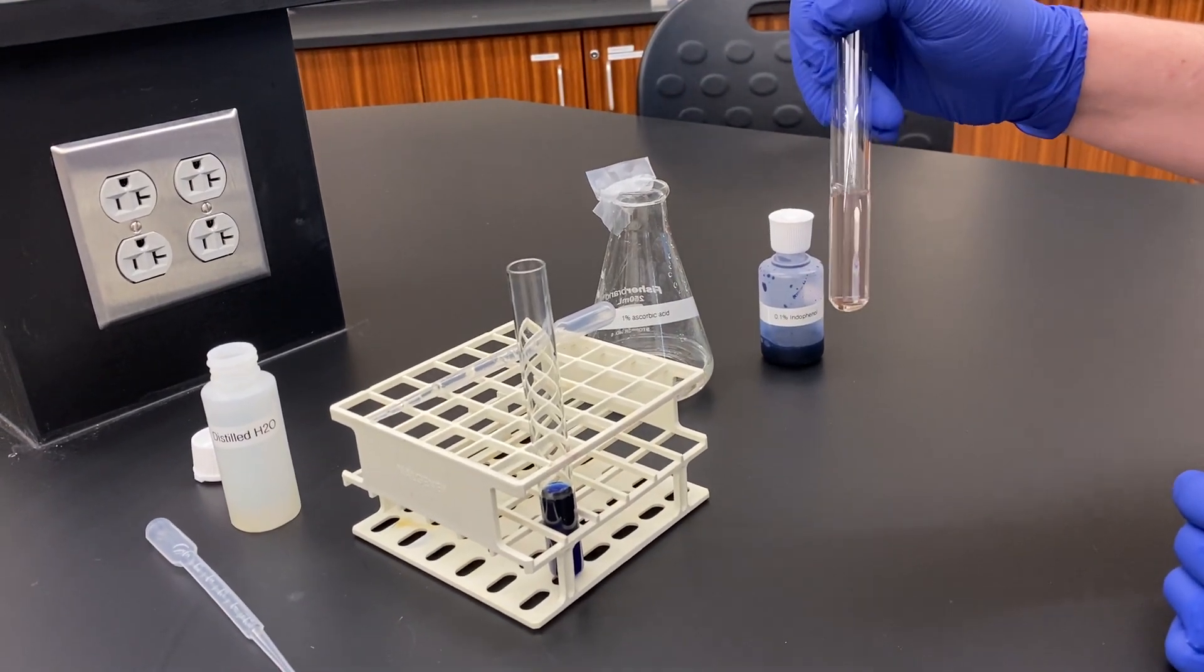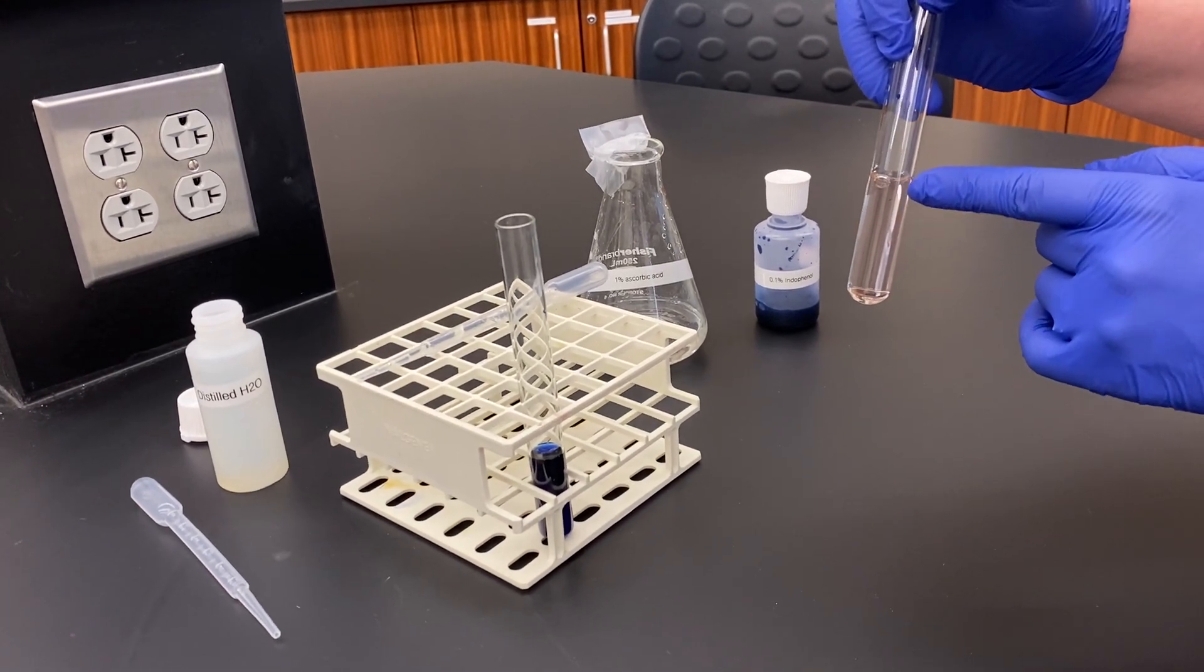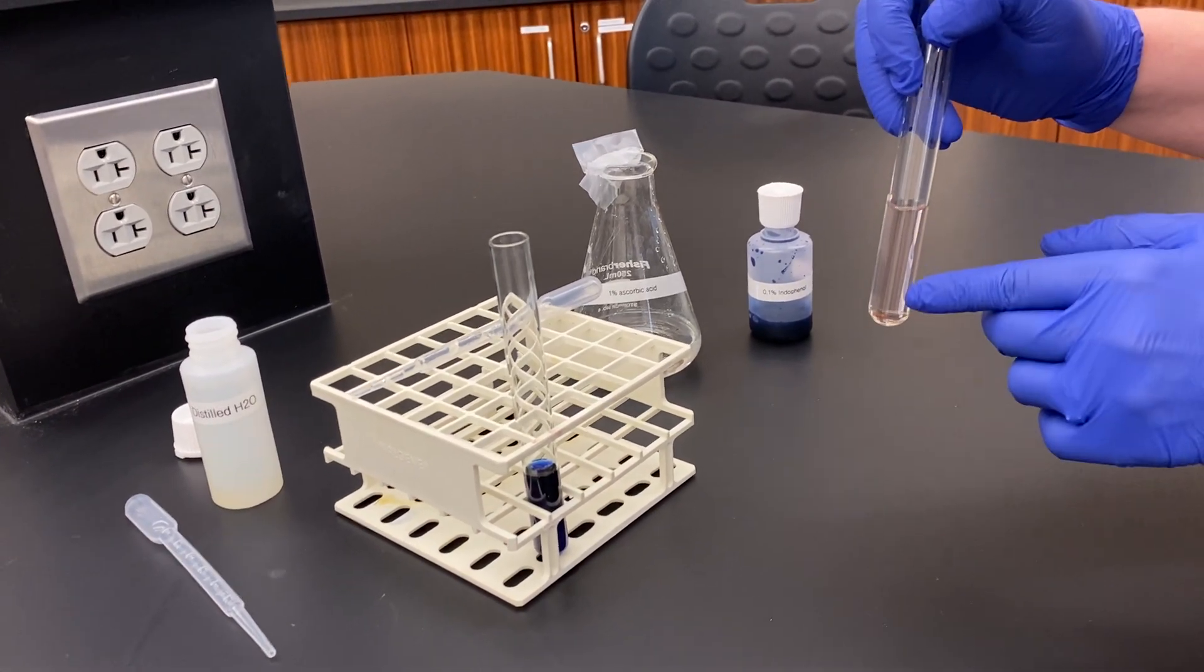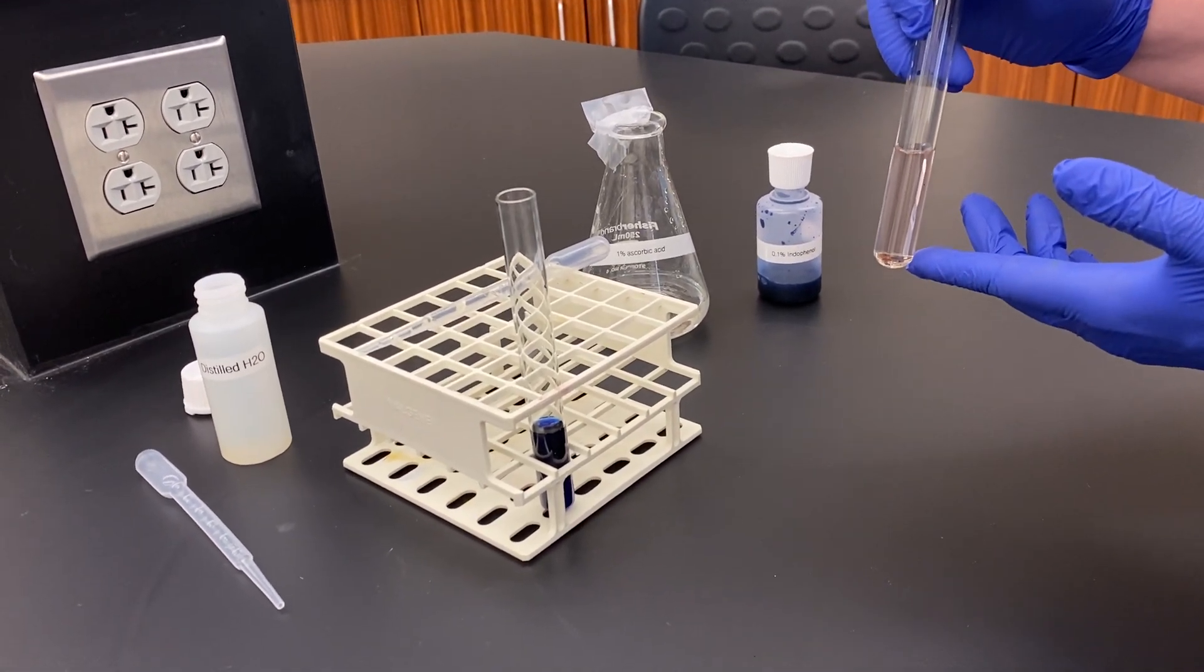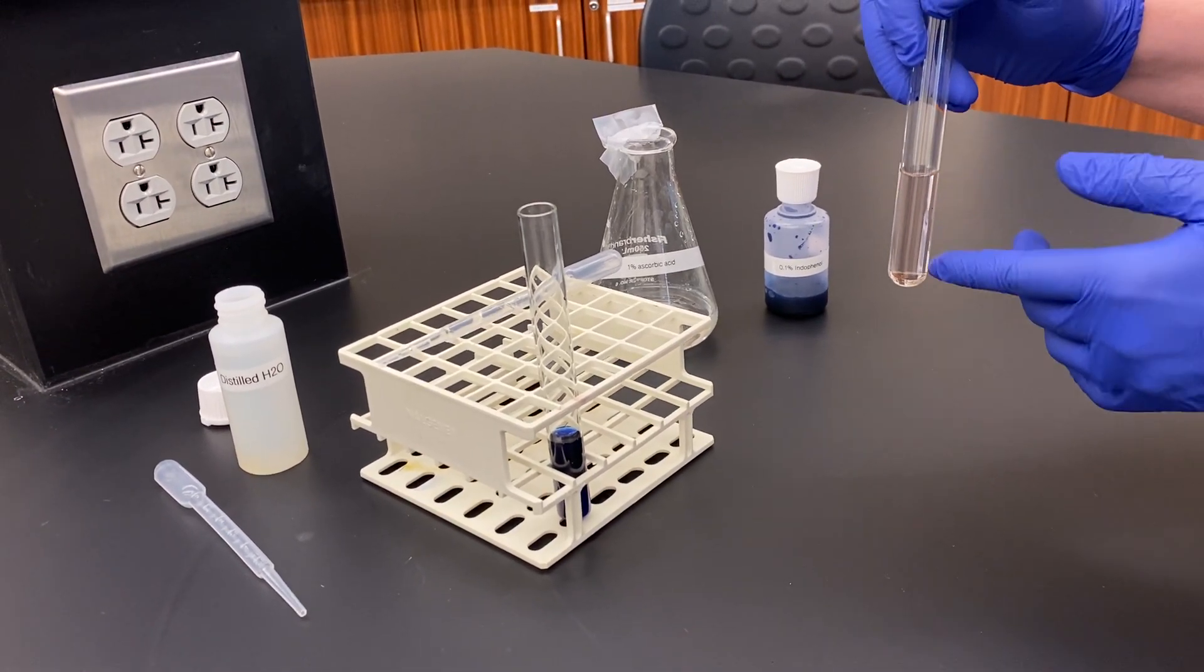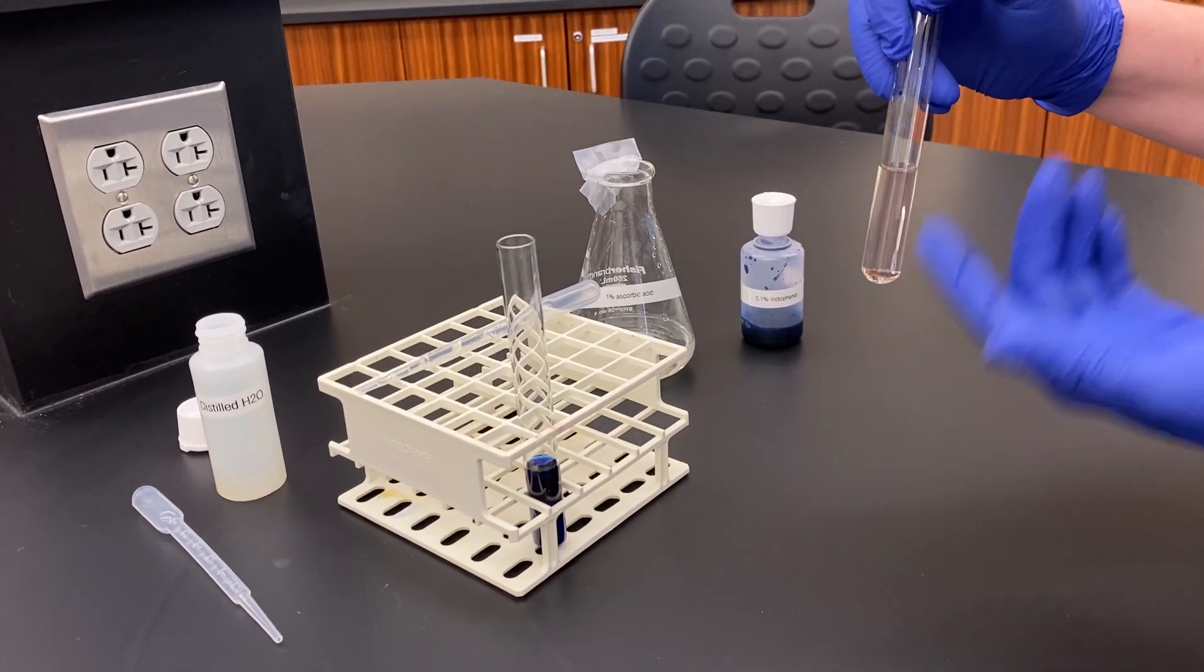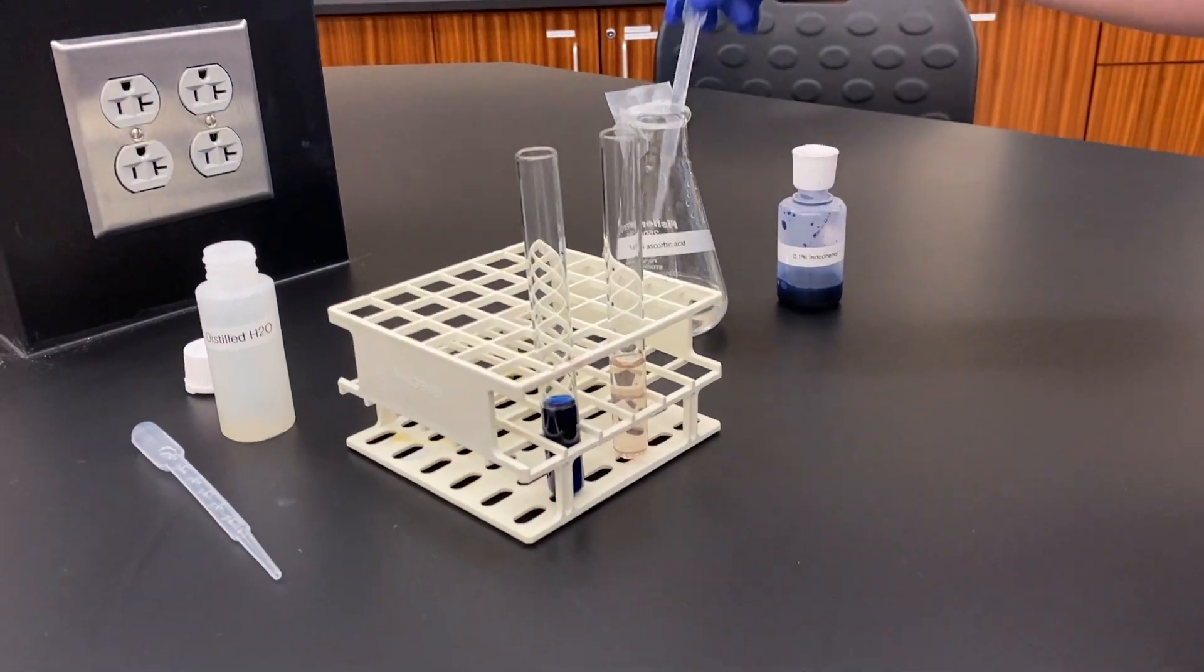Your end results should be a clearer color. It's not going to be exactly clear like water, but you should be able to see a clearing of that dark blue. The more vitamin C it has, the more clearing you're going to be able to identify. A lot of vitamin C will have a full clearing, and that's going to be a very lightly pink solution and much more transparent than what we originally started with.